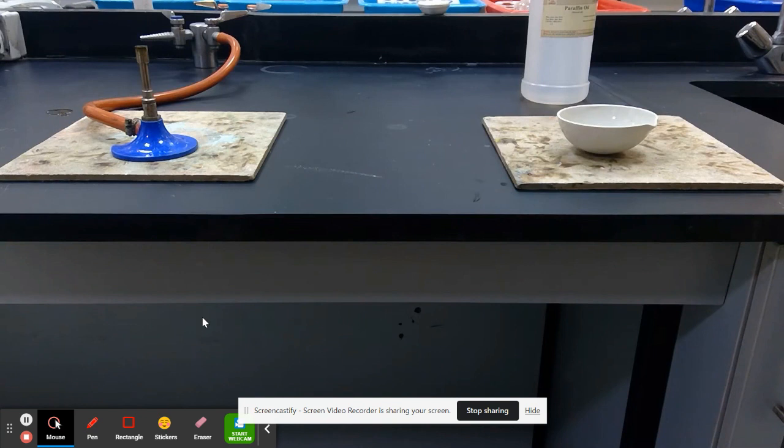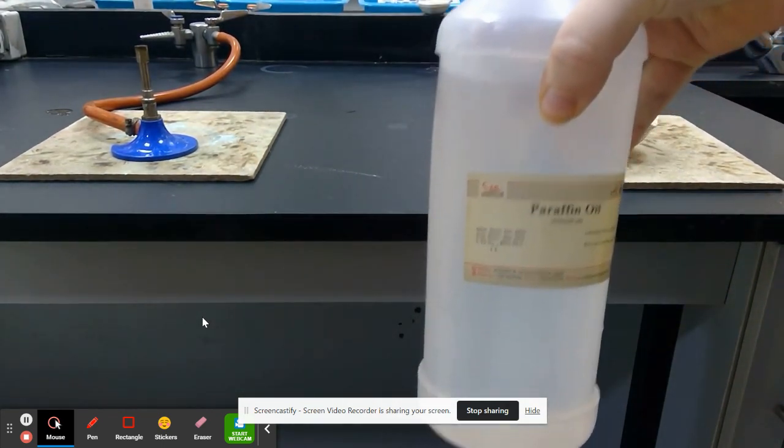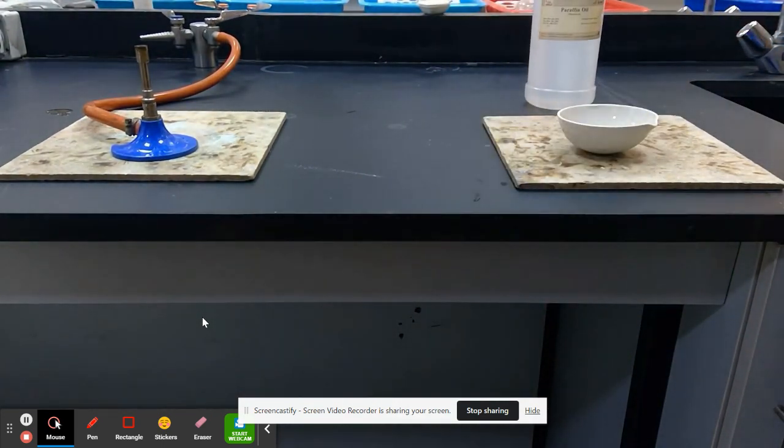So the first key difference that we should be able to notice is that methane, as we know, comes out of our gas taps. It is a gas at room temperature, whereas paraffin oil is, as you can see, a liquid at room temperature. So clearly there is a difference between their boiling points.